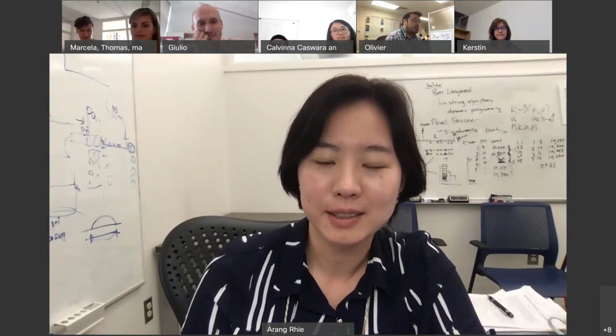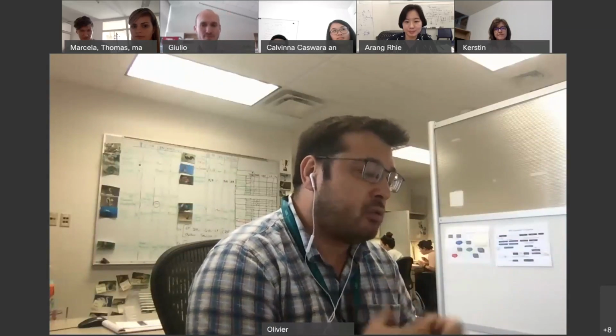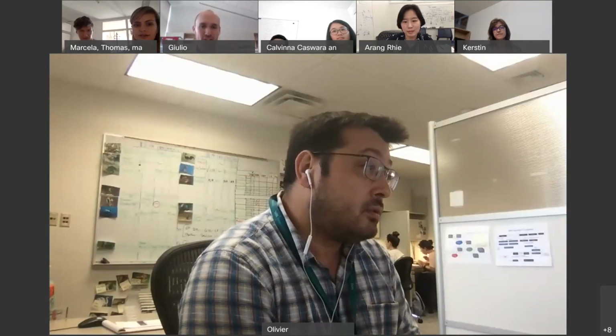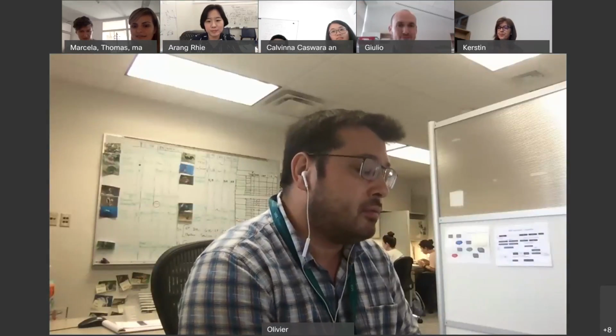In a lot of cases we don't have all the full data sets like PacBio and 10x. Just say it's ready to start, and people can start on that. Even if you have only PacBio, I would start. Okay, I will flag them.